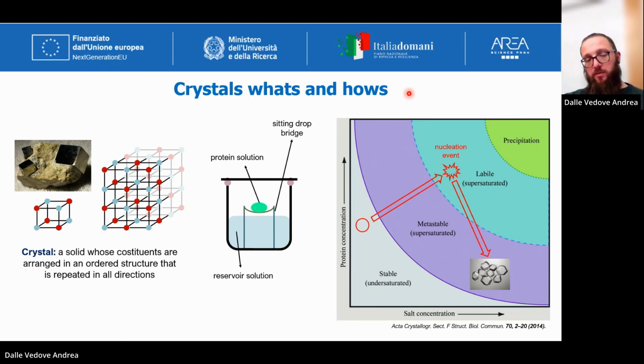Now this is a closed environment, and through vapor diffusion, we have the progressive dehydration of the protein drop.